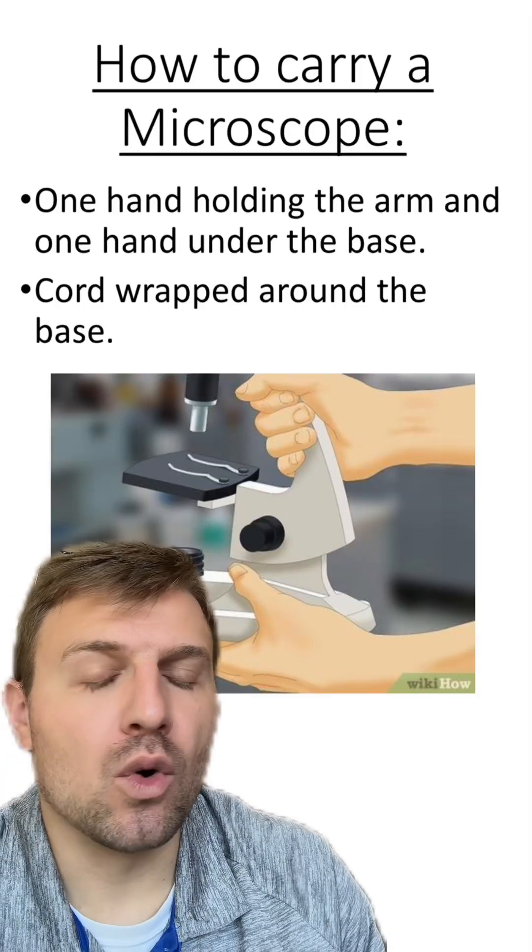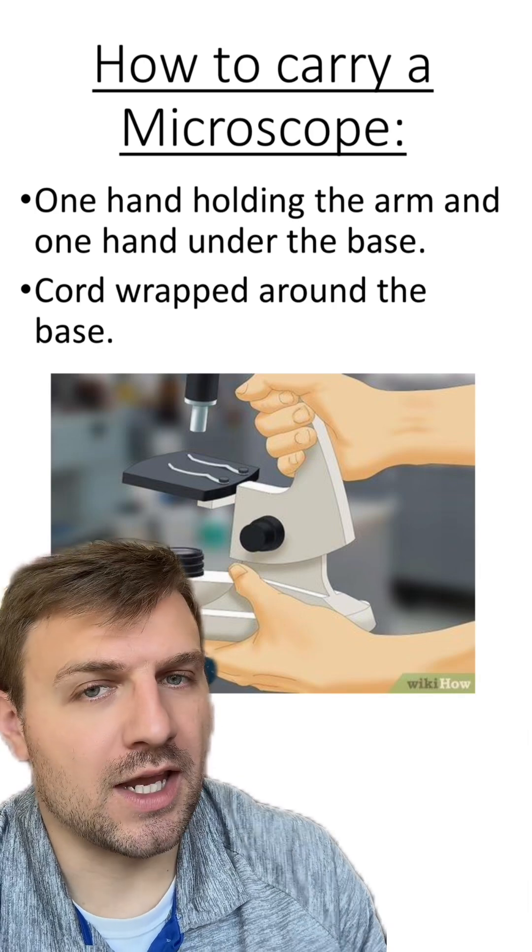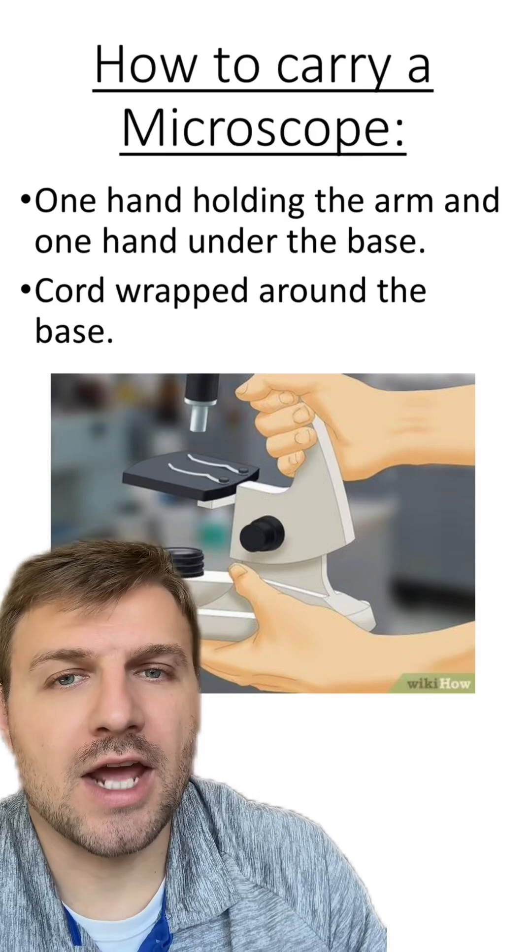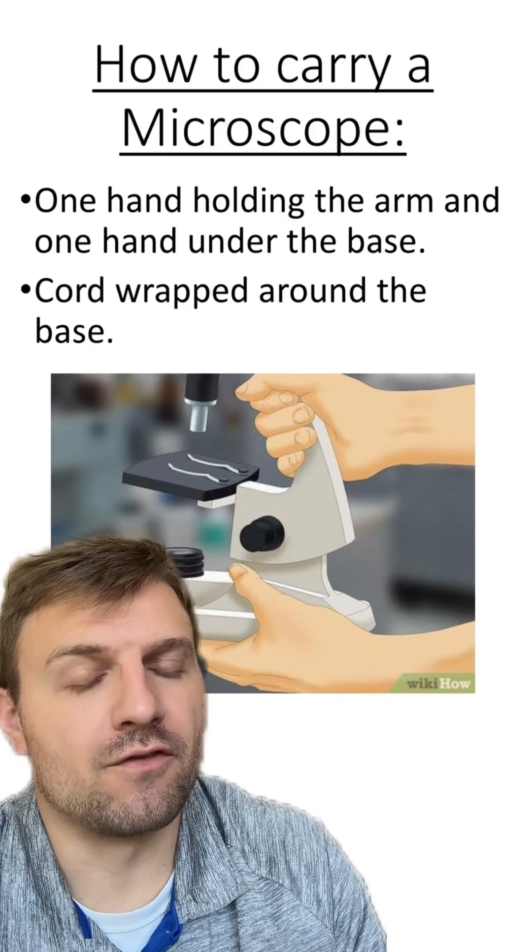When carrying a microscope, you hold one hand on the arm with one hand under the base. You also should have the cord wrapped around the base so you don't fall and trip on it.